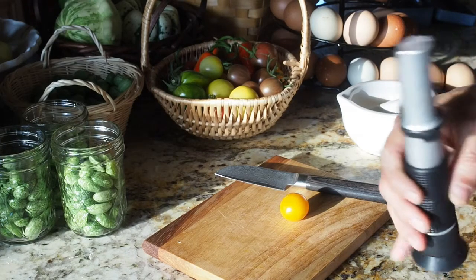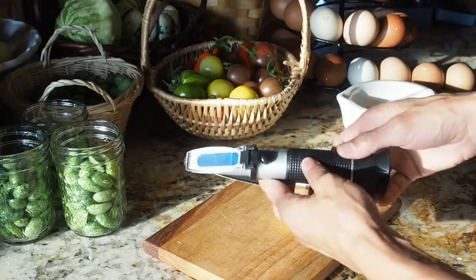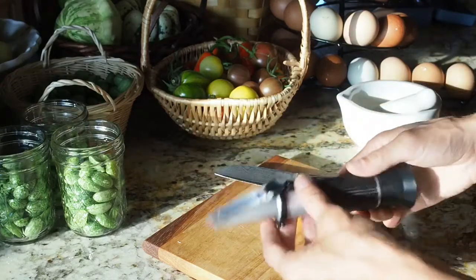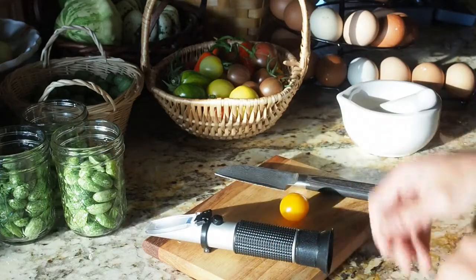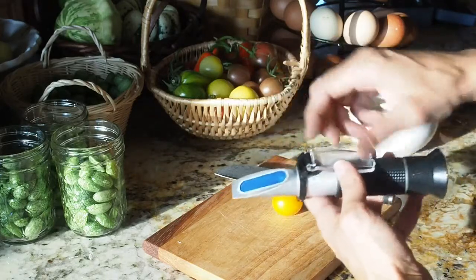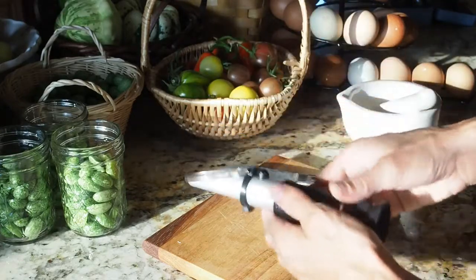Today I'm doing some Brix testing on my tomatoes. This is a refractometer that I got on Amazon for around 60 bucks. It's a way to test the sweetness of your tomatoes, and you can do a comparison with supermarket tomatoes to see the difference. You basically put the juice of the tomato on this plate, push that down, and look through the viewfinder and it'll tell you what the Brix of your tomato is.